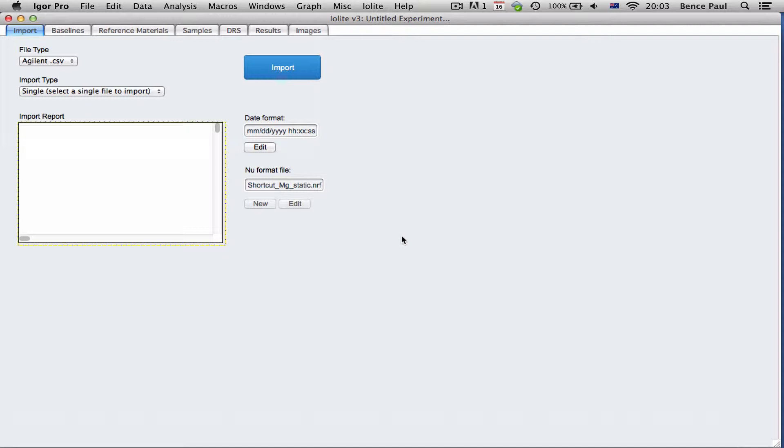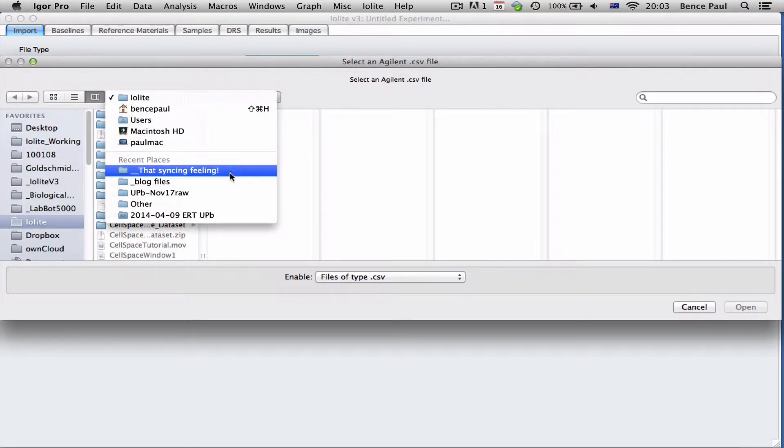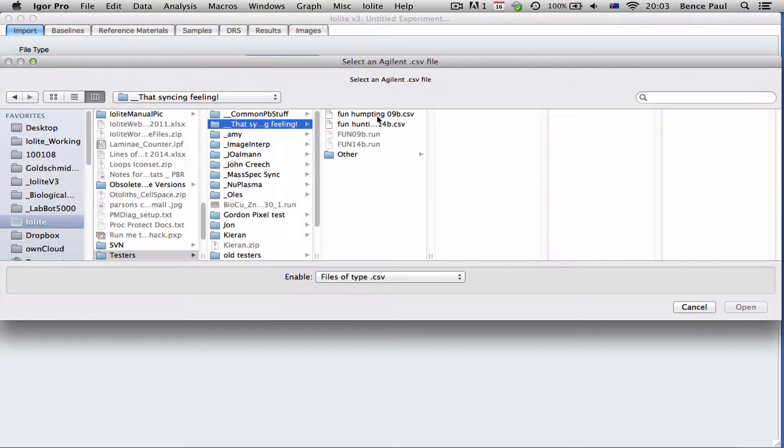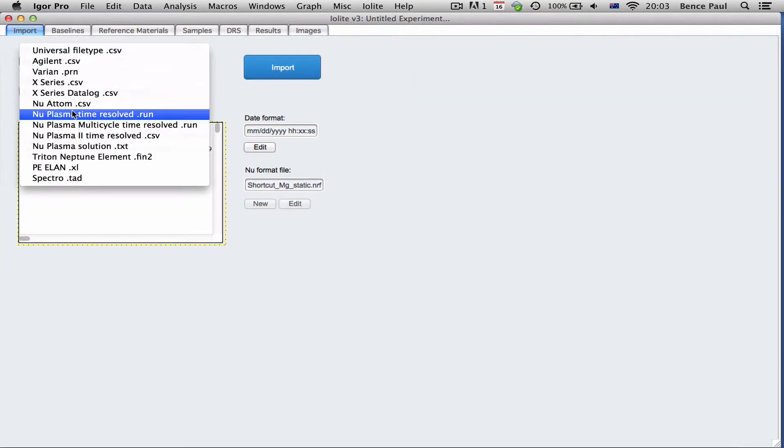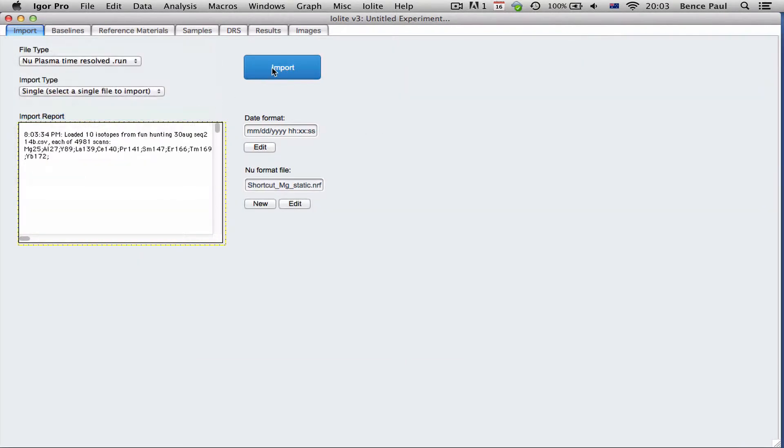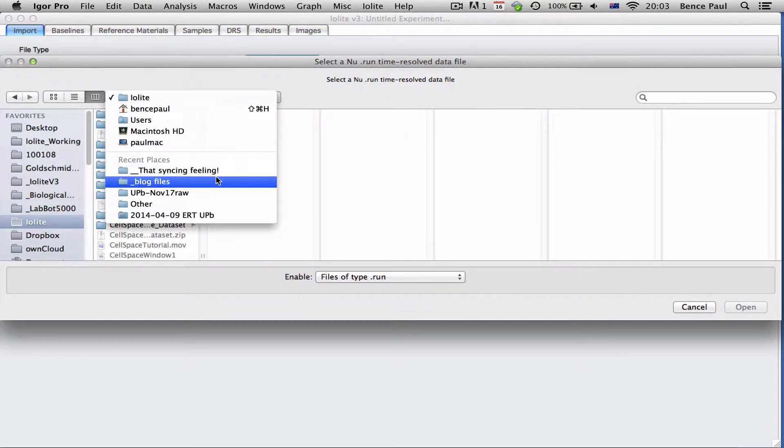So I'm going to load both of those data sets now. I'll start with the trace elements and now I'll load the multi-collector data, the magnesium isotope data.